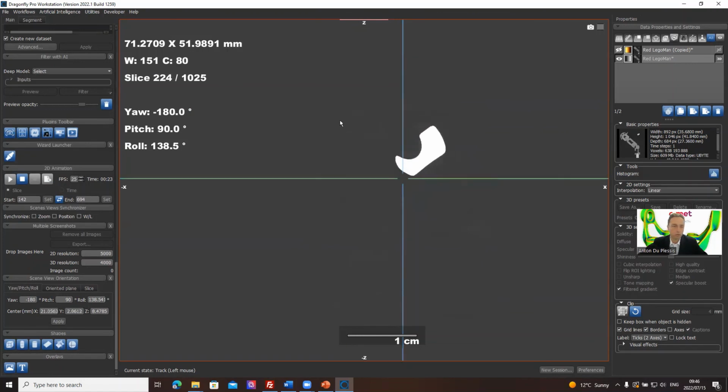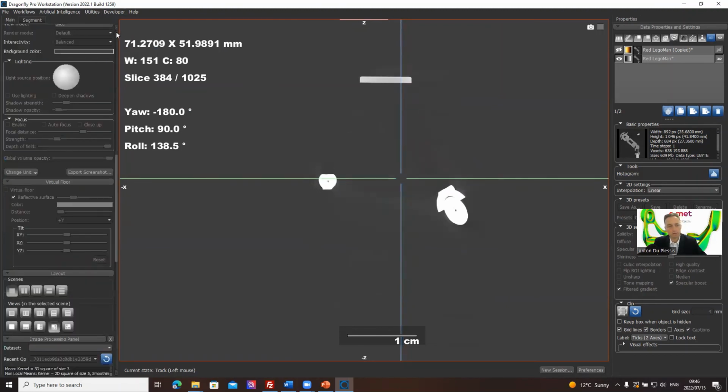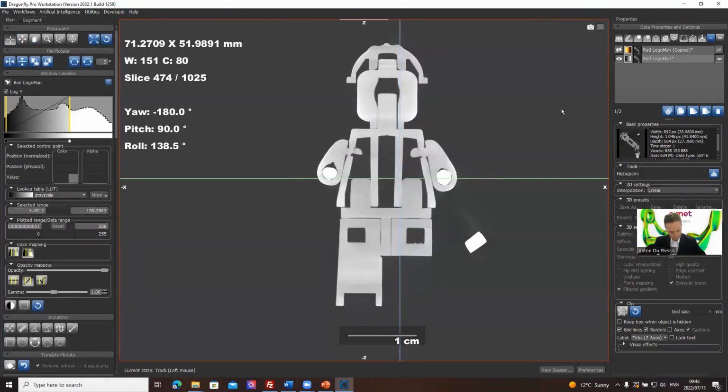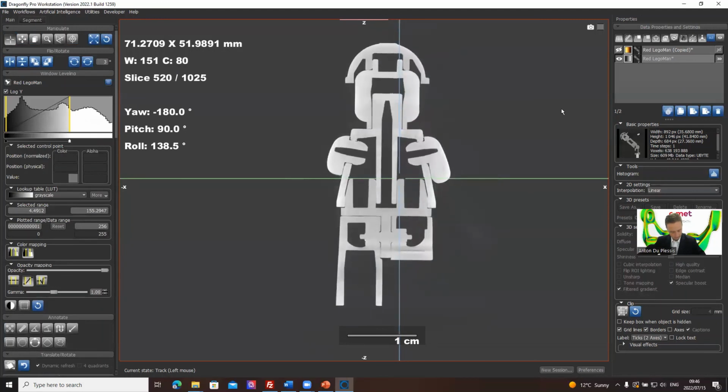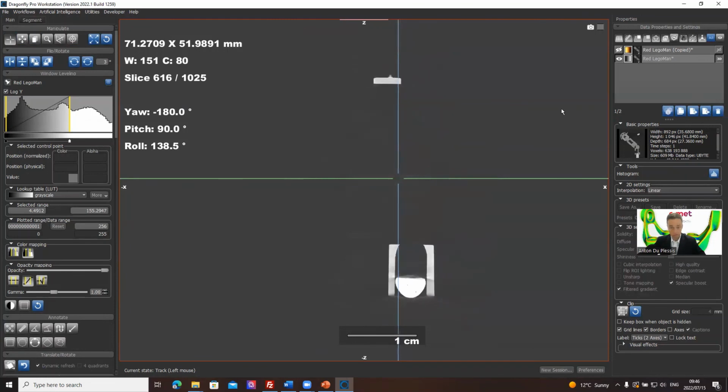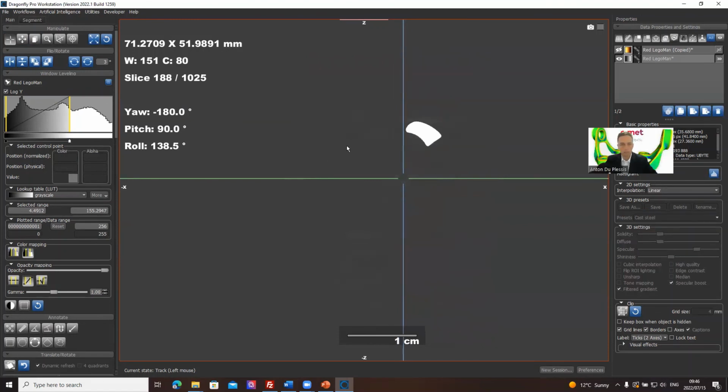And you could also put the crosshairs away using another state, for example, the panning state. All right, let me see if there's anything else that I wanted to show you. I think I've covered everything. We've got a lot to do in the other videos, so I don't want to make this one too long. That's basically it. Let's stop at that point.